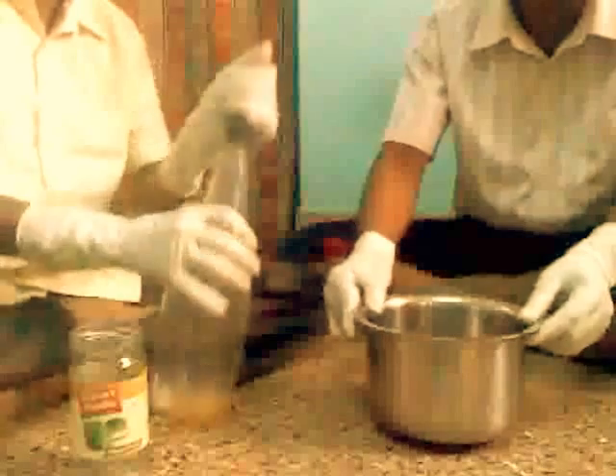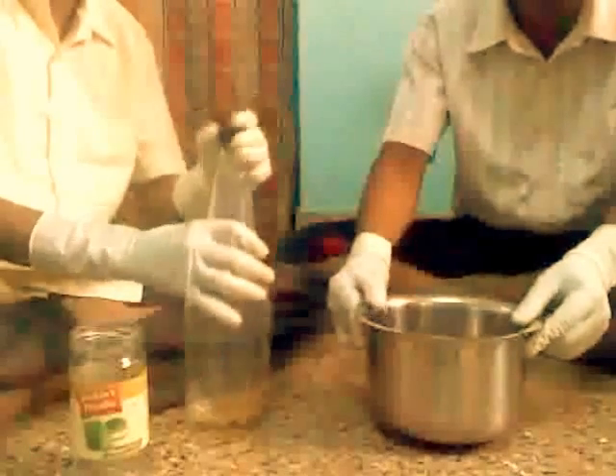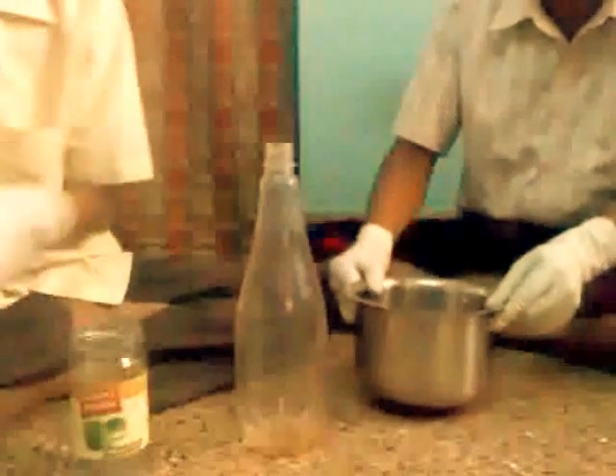Why 60 degrees? Because for the mixing of sodium methoxide, it dissolves properly up to 60 degrees centigrade. Now we have to pour this 60 degree Jatropha oil into the bottle using a funnel.